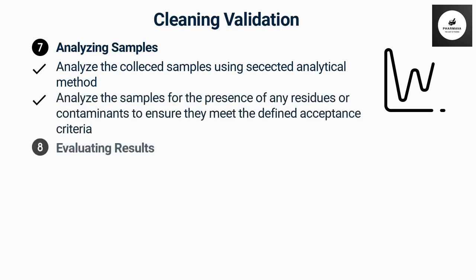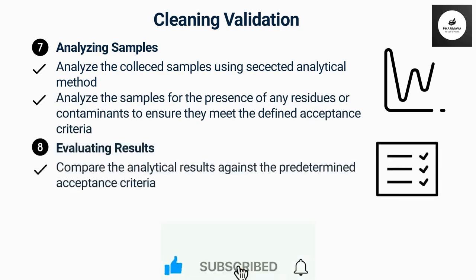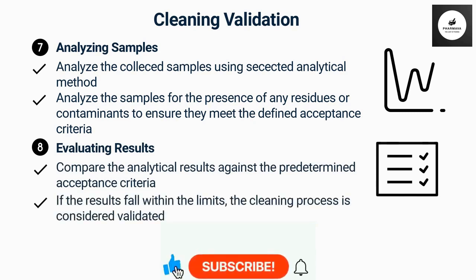Step 8. Evaluating results. We compare the analytical results against the predetermined acceptance criteria. If the results fall within the limits, the cleaning process is considered validated. If not, corrective actions and revalidation may be necessary.